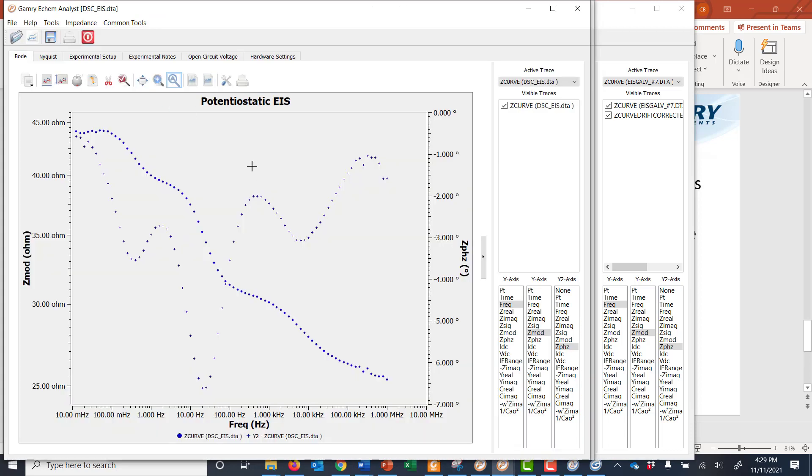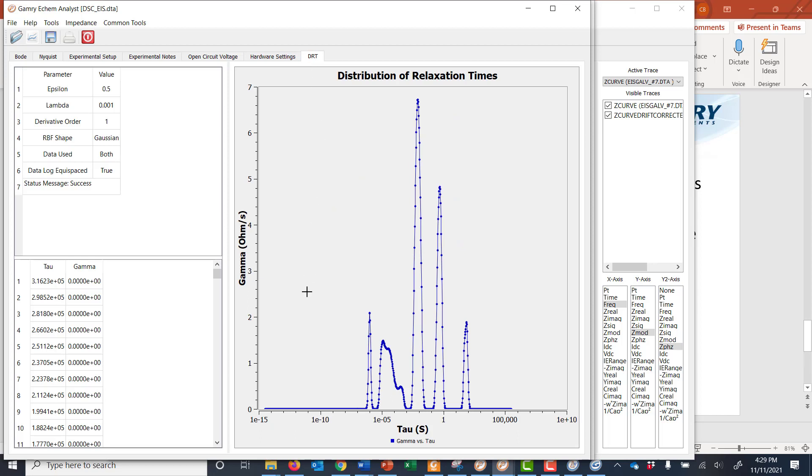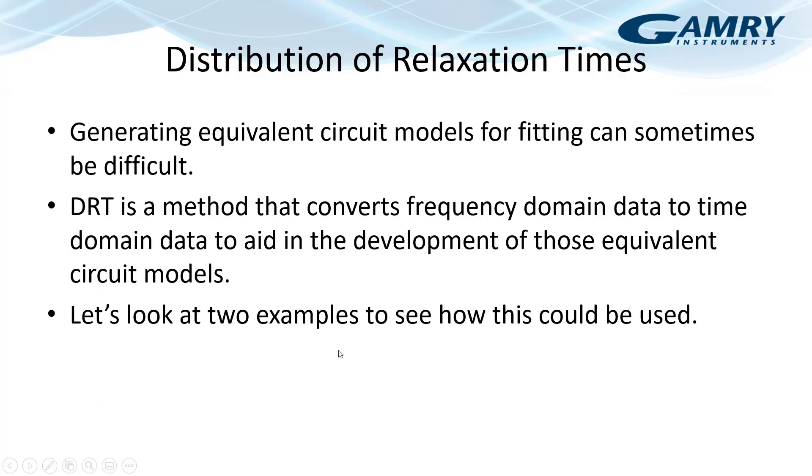If you look at more complicated data. So this data, obviously, you can see is much more complicated. This is a dye solar cell. There's multiple interfaces. There's a separator in the cell. So we have plenty of RC time constants. So again, if we go to the impedance menu, click on distribution of relaxation times, we're just going to do an auto fit here. And we can then go to this last tab. And we see a much more complicated spectrum compared to the Randles dummy cell that I just showed. And of course, we see multiple peaks that could be related to multiple time constants here. So again, these are all useful tools that you could use for your data acquisition and data analysis.